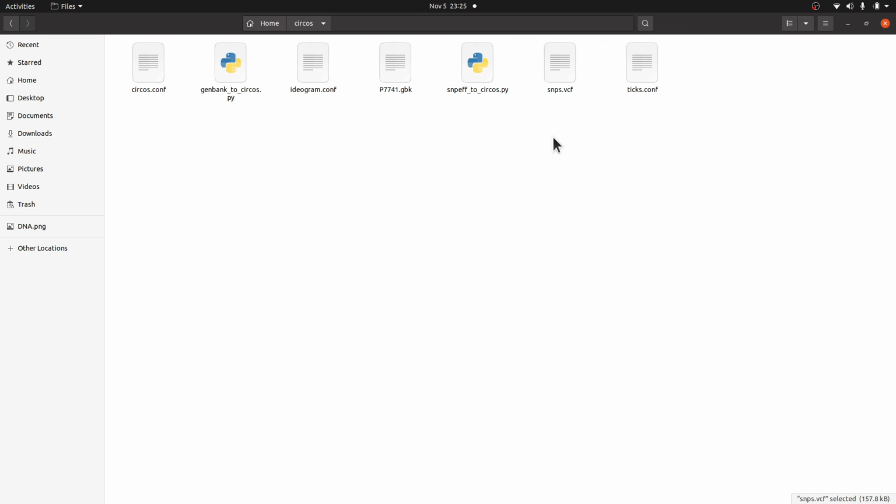So I'm going to look at the distribution. I used SnpEff to annotate and obtain the high impact variants. For SnpEff, I have tutorials that show how to use it. So check the description, you'll find links to those videos. So I have them here. Now with Circos, you also need to get some additional files. By default, you have to generate these from custom scripts.